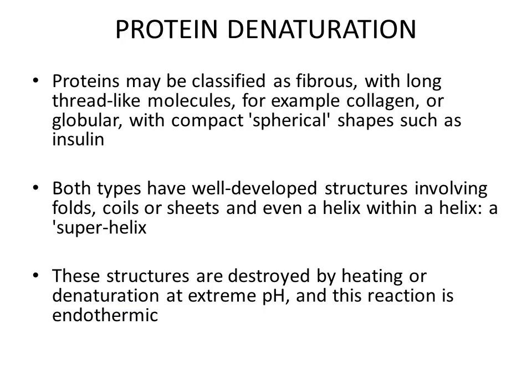Another application is the study of protein denaturation. Proteins may be classified as fibrous with long thread-like molecules, for example collagen, or they may be globular with compact spherical shapes such as insulin.